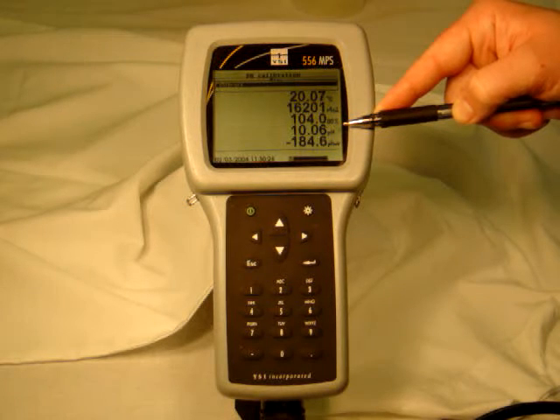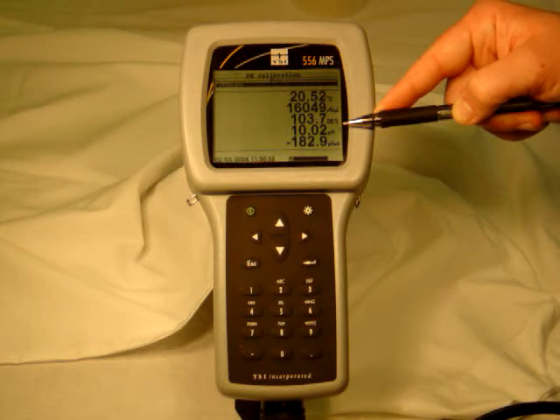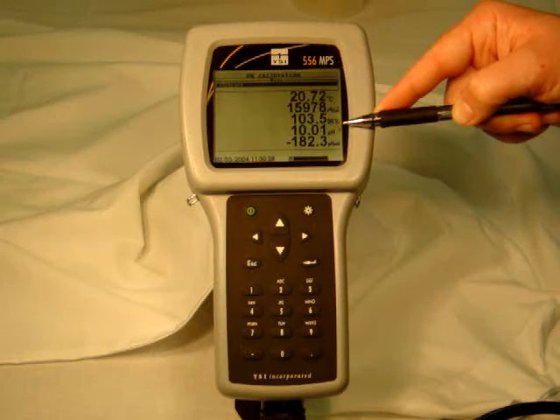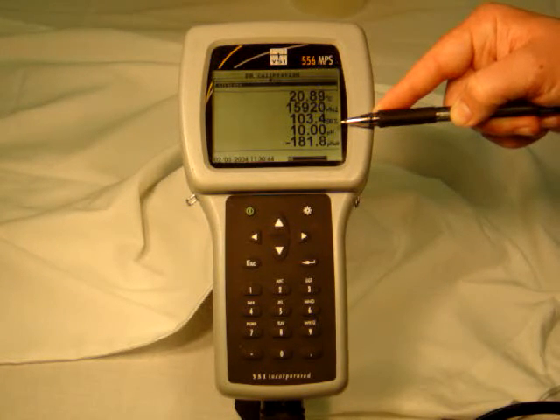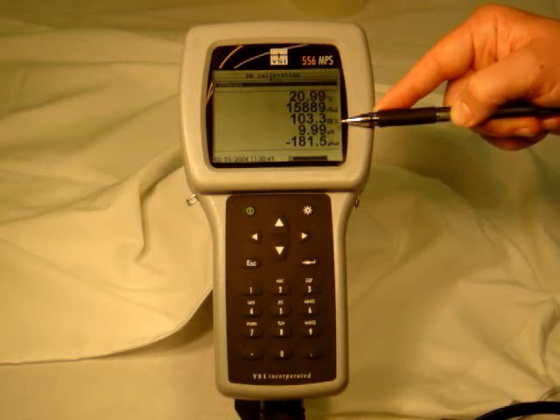Hang on, just let this cut out. I want to get real-time, you see? Quite dull. I just wanted to show real-time — I think that's the thing we're missing, real-time response. Quite a good response on this. Look how the temperature's changing.